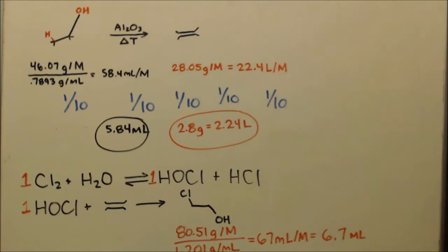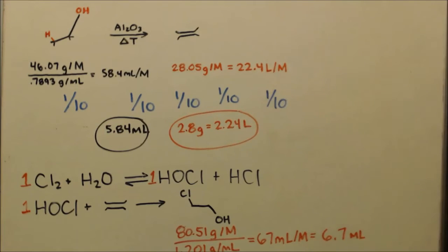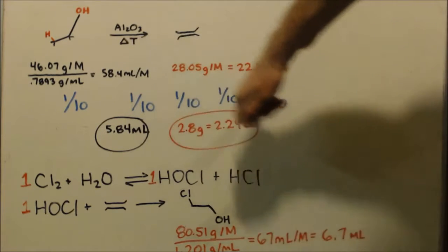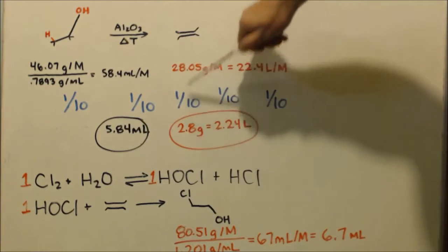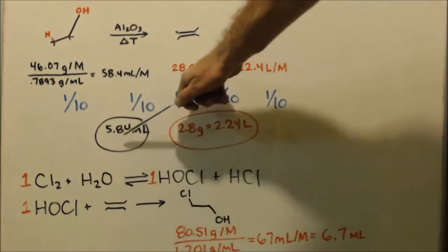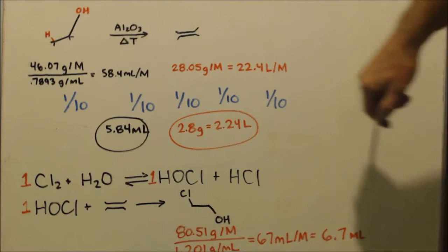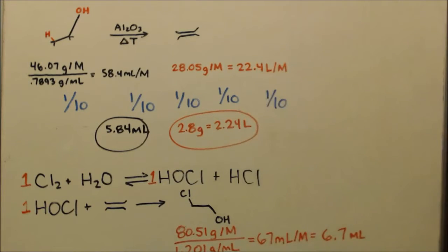Now I wanted to take 1/10 of everything. That gives me 2.24, 2 1/4 liters of gas. That's at least controllable. So I took everything by 1/10, or I just moved the decimal over 1, basically. 2.8, 28, see? And that's how I figured out what I'm going to put in there. I'm going to put this much alcohol, this time ethanol instead of rubbing alcohol, vodka. Well, actually, it's anhydrous. And I'm going to get that much out.